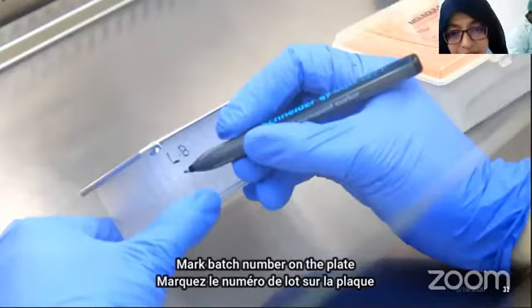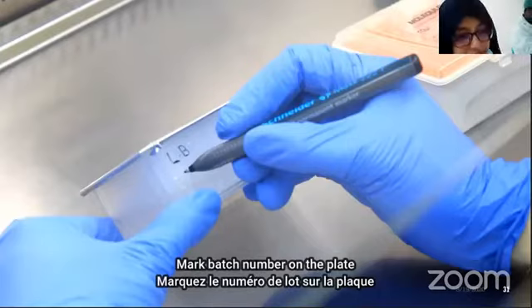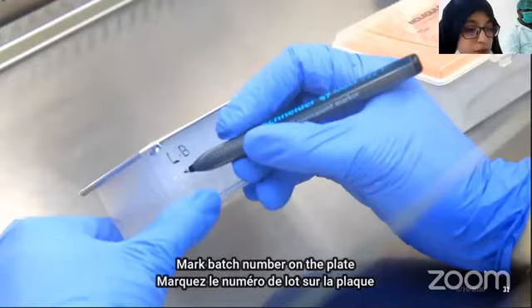The next question is, is automated and manual sample preparation different? Basically, as mentioned earlier, the same sample type is used, but sample preparation is different for manual and automated extraction. You can also see in my videos that in manual extraction we add carrier RNA, along with the extraction control and all other things, but in automation we use proteinase K. So the samples are the same, but the extraction processes are different. I will discuss the difference between manual and automated extraction after some time.